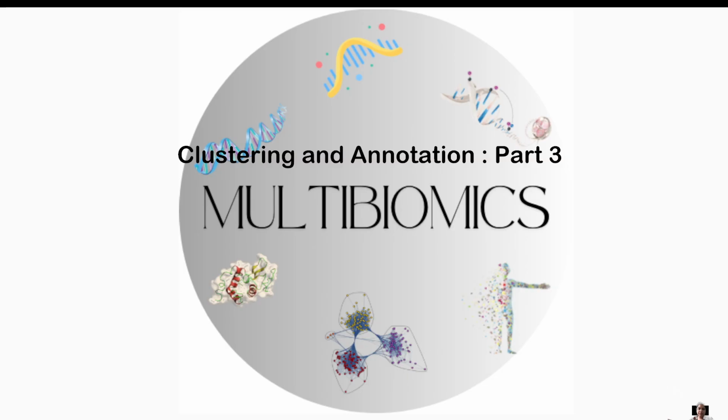Right, we have already clustered our cells in the second part of our video. So if I tell you the workflow, basically we had reduced the dimensionality of the data set with the help of an unsupervised algorithm known as PCA. So the PCA finds the major variances in the data sets. We have found two principal components, that is PC1 and PC2. These are the set of genes which provide the maximum variation in the data set.